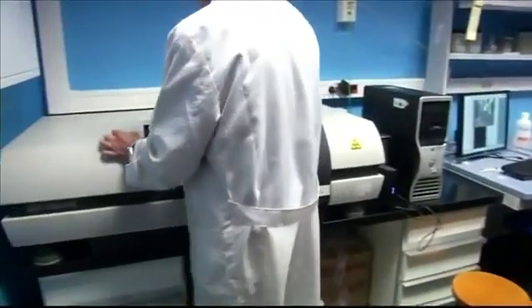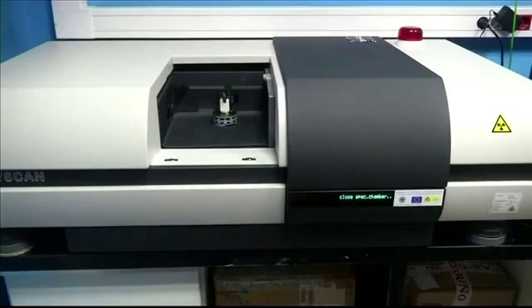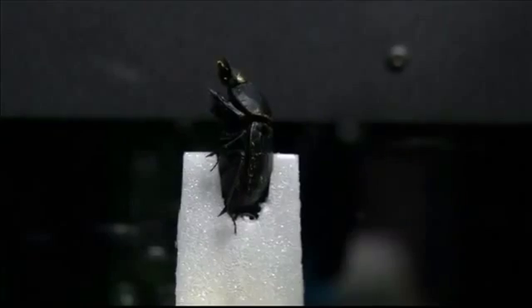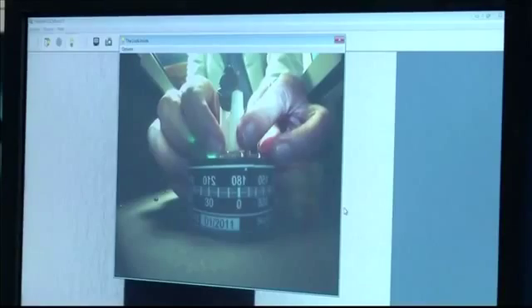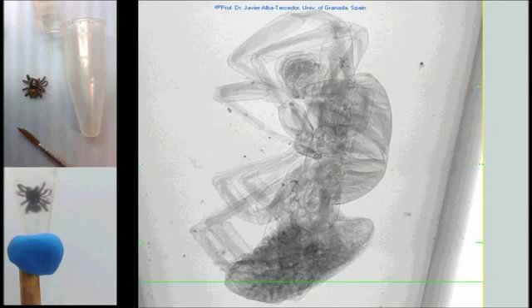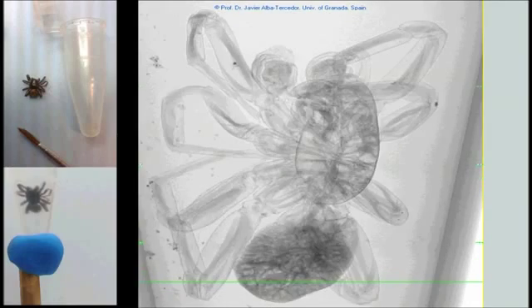He uses this scanner, the SkyScan 1172, in his laboratory at the University of Granada. Here, there is an X-ray and a camera, and the stage starts to rotate slowly — only 0.5 or even less degrees each time.